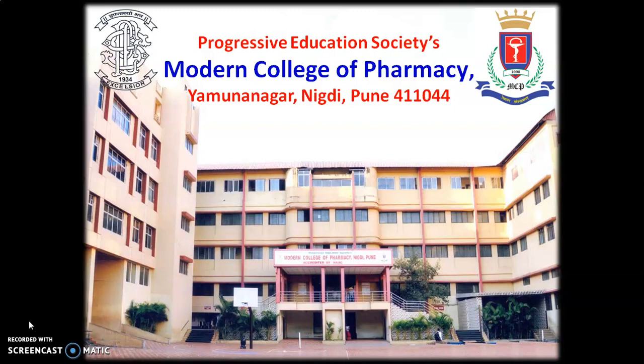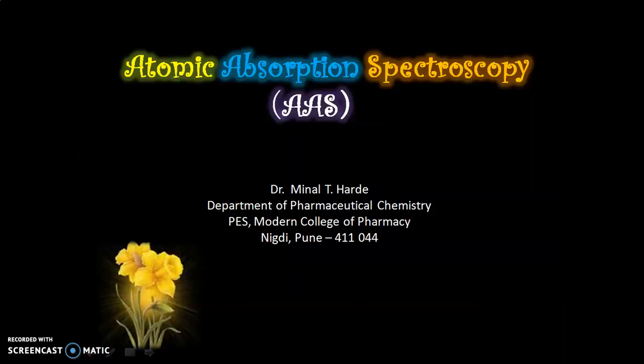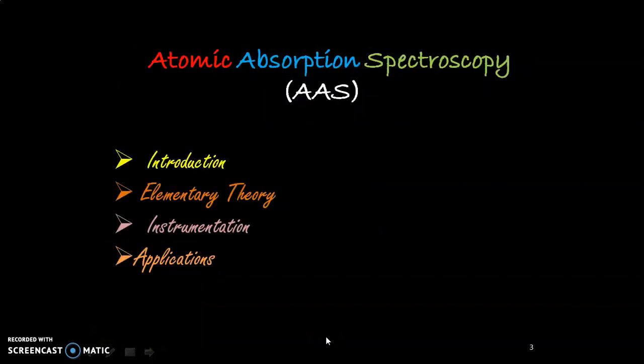Today we are going to see details on the topic Atomic Absorption Spectroscopy. Atomic Absorption Spectroscopy is a technique in which we are determining metals as well as non-metals. So today we are going to see content such as introduction, theory, instrumentation and application.